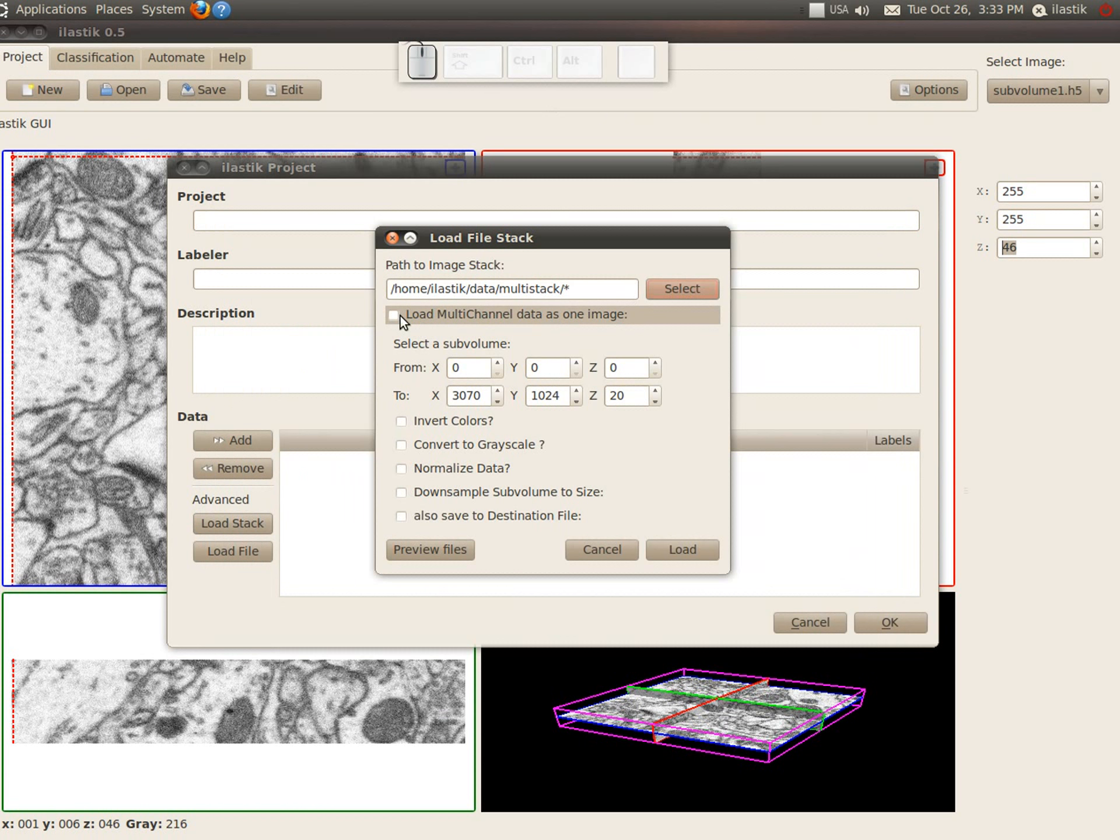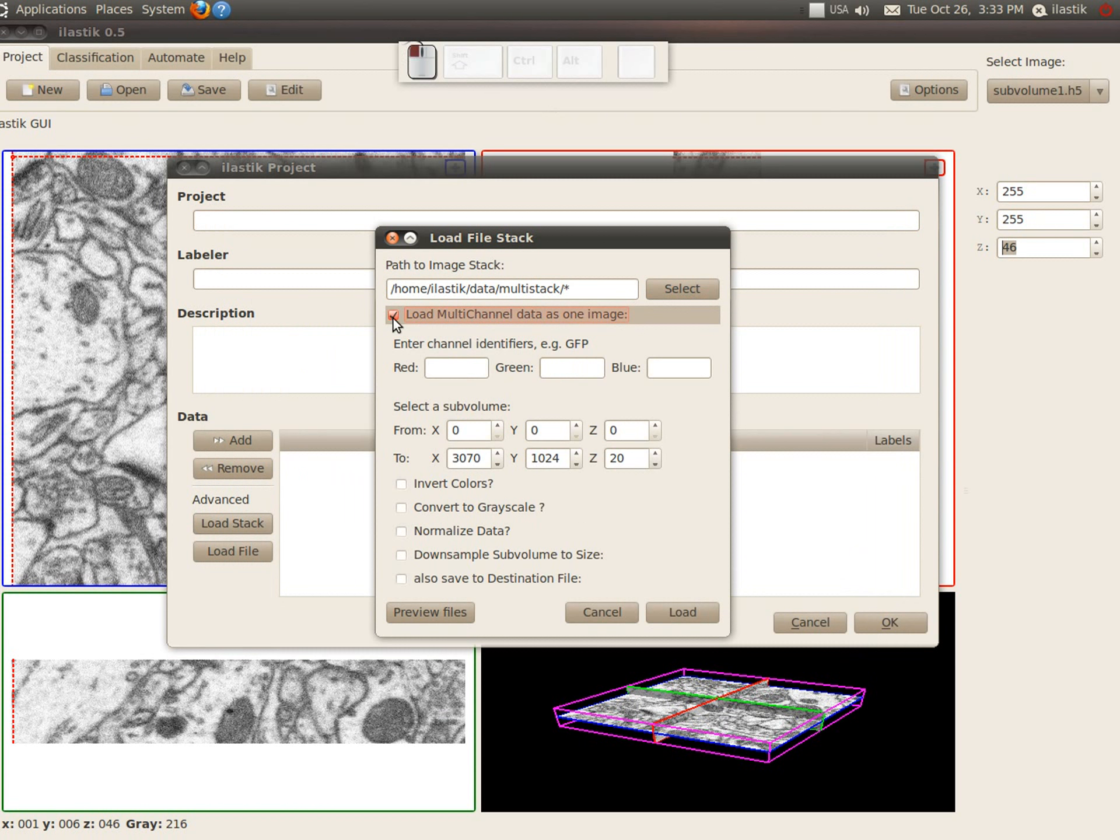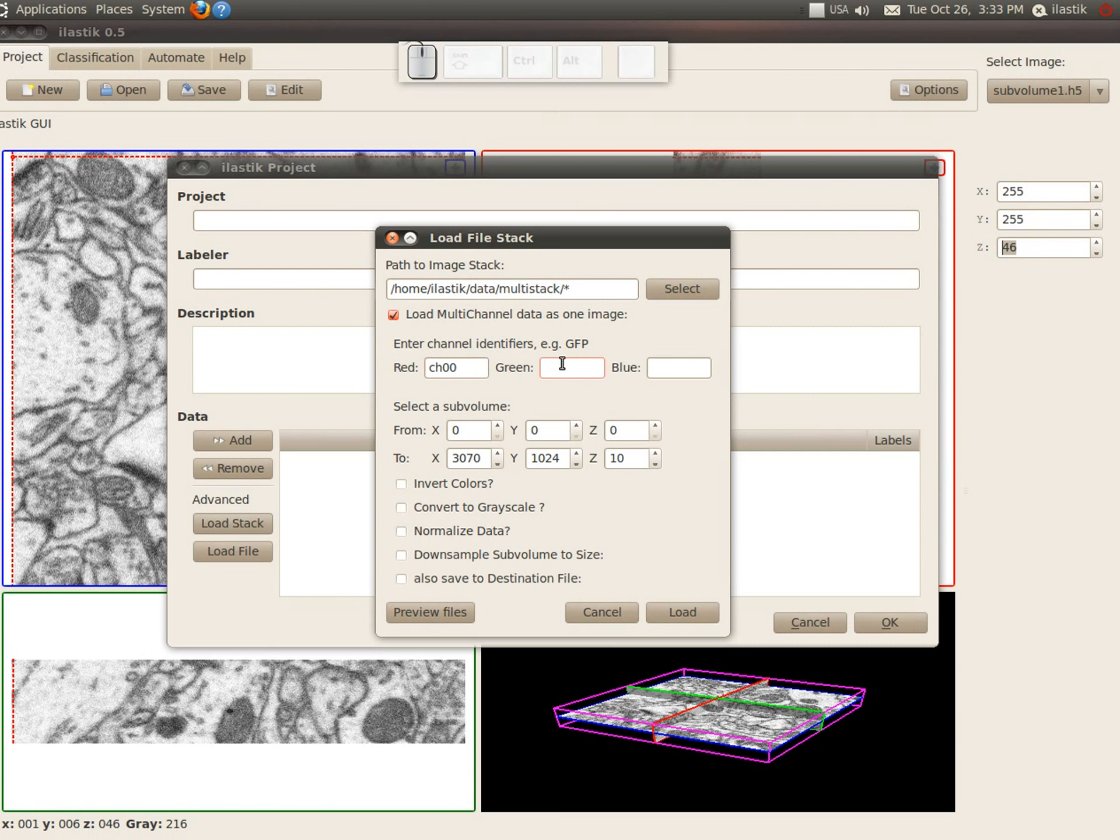And here we see the option that load multi-channel data is one image and we can put the channel identifiers for the different colors.